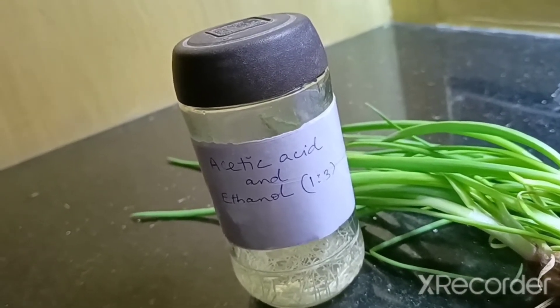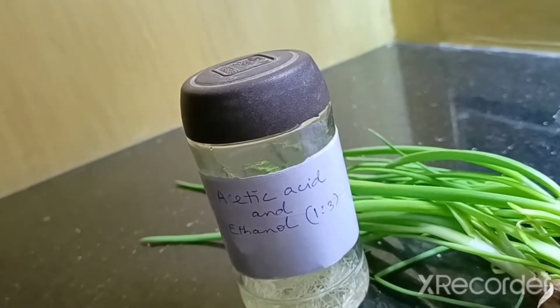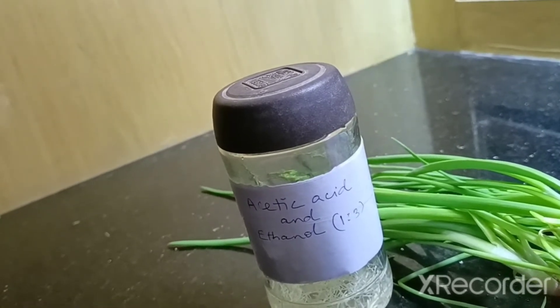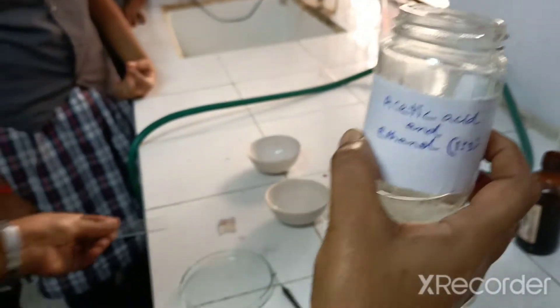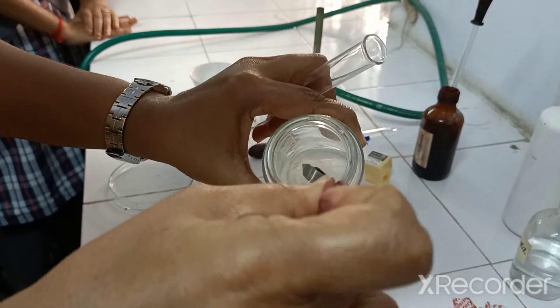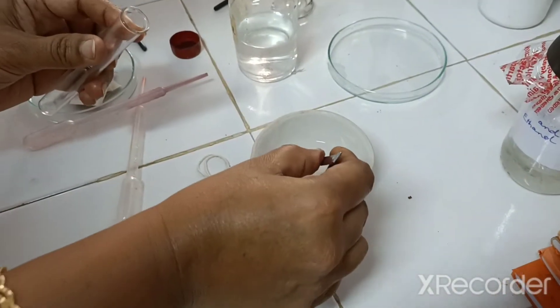From here we take out the root tip and hydrolyze it by warming to 60 degrees in hydrochloric acid for about 15 minutes. After washing in water, the tips are preserved in acetic acid and ethanol in a 1:3 ratio. We are now taking a few of the onion root tips for hydrolysis.